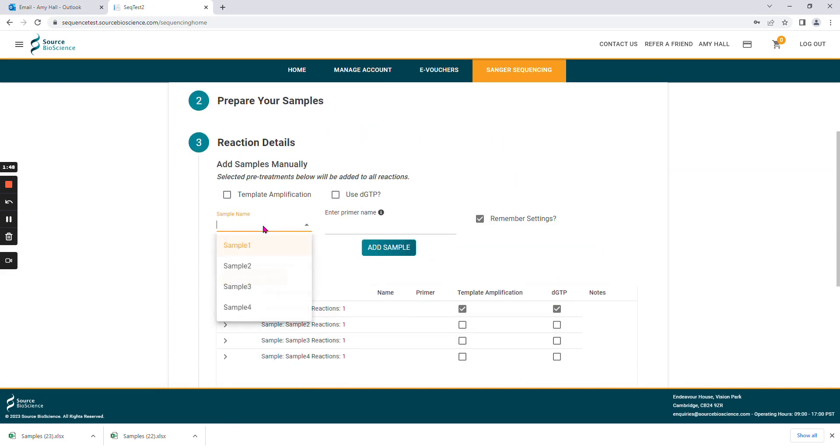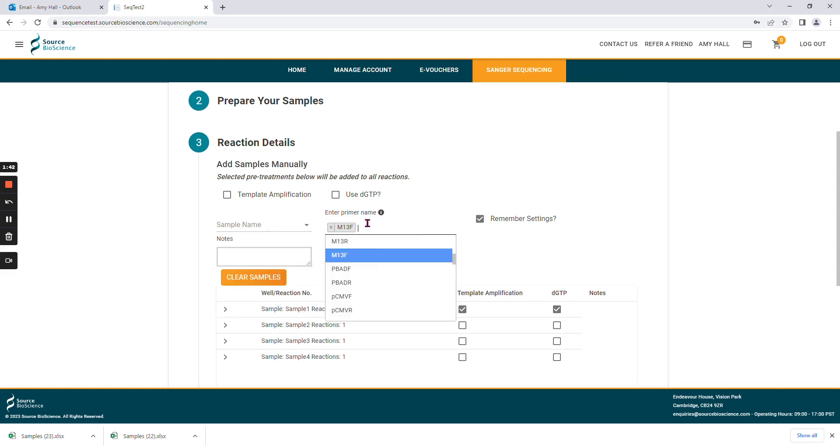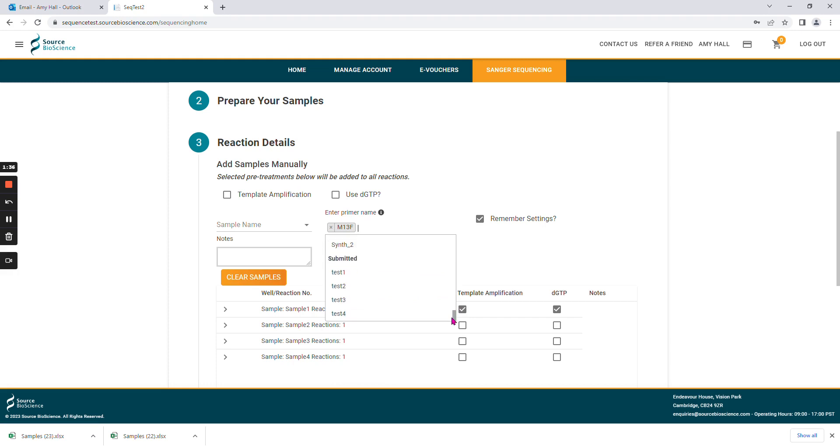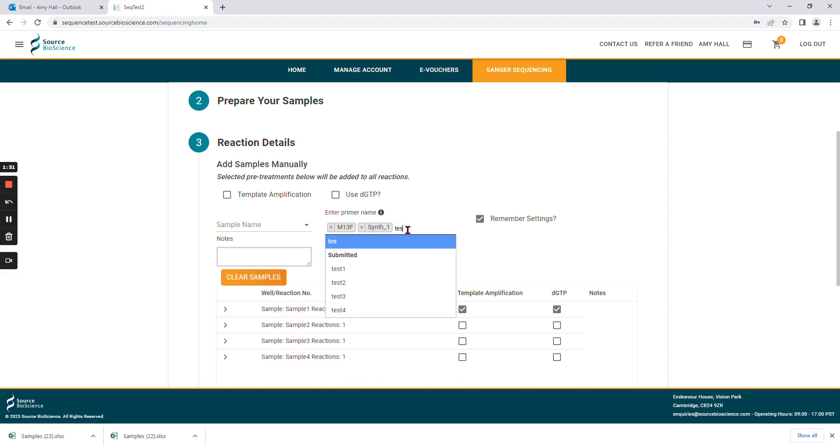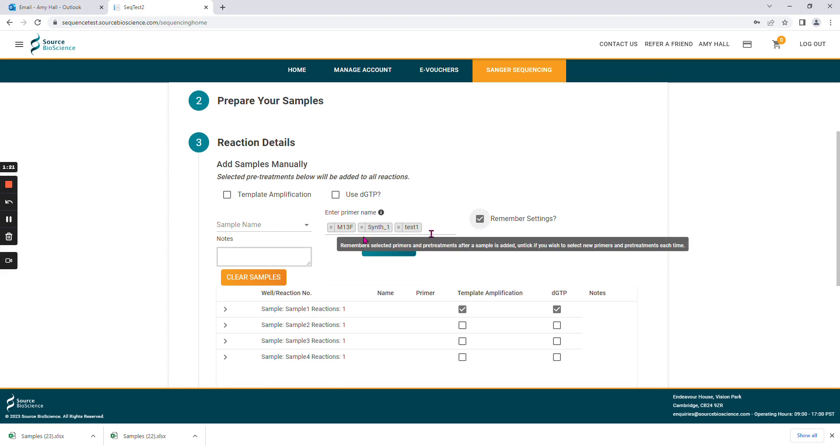Here you can type in your sample names and choose any primers that you wish to use for sequencing. The drop-down list is again our in-house primers, and your synthesized primers will be at the bottom of this list. Or you can choose to type in a new primer name. If you have this button selected here, this will remember the primers that you've selected, so that you can use them for subsequent samples.